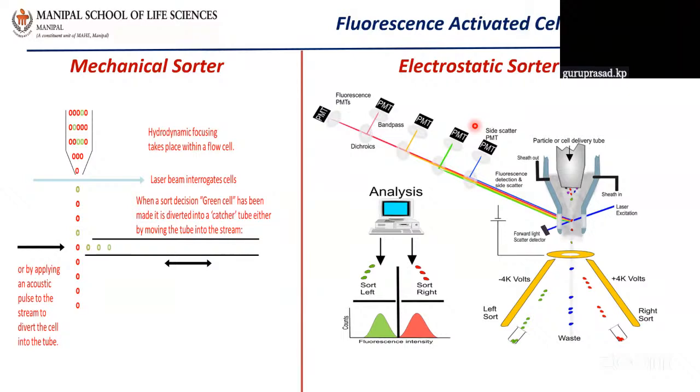And what is the fate of a cell? Cells are going to the waste. But in our experiments, we may need some cells for our experiments. Say, if I take blood and want to isolate only T lymphocytes, it is not possible for me using many techniques outside. So using flow cytometry, I can separate the cells. I can have only T cells in my hand.